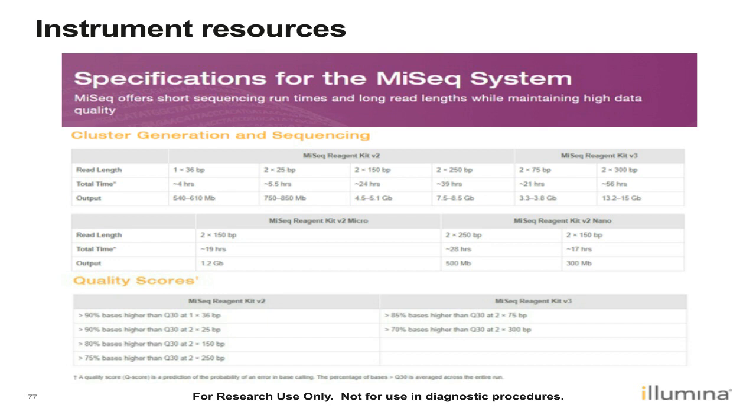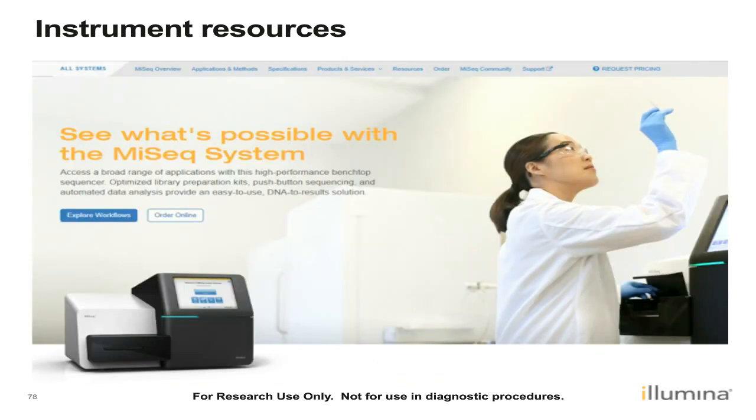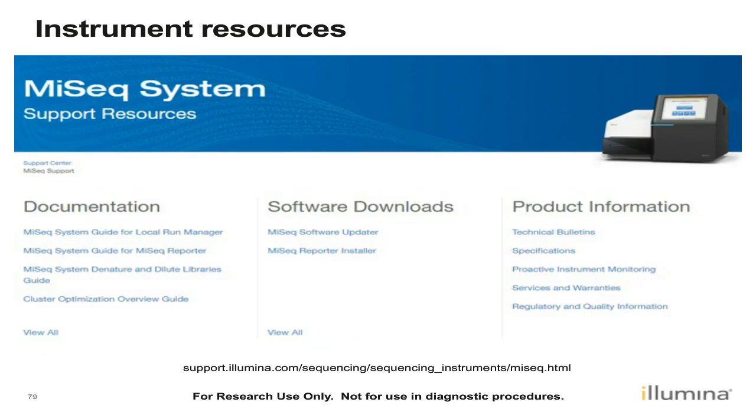We can go back to the main instrument page, and now let's select the support option near the top right. This will bring us to the instrument support page. This page has information for handling sequencing consumables, instrument maintenance information, and a lot of other very useful resources.